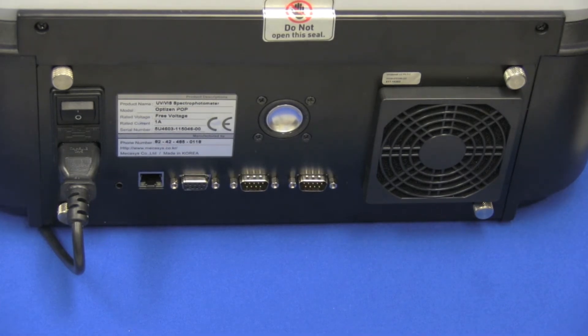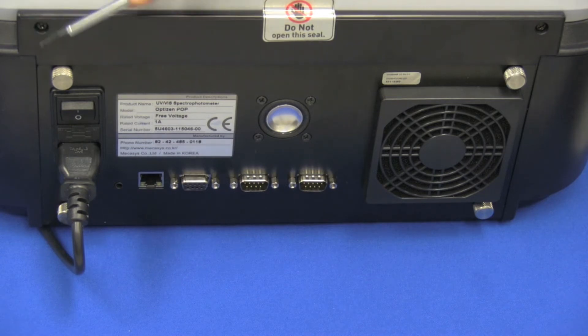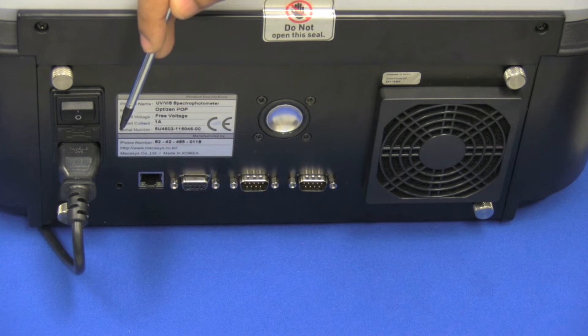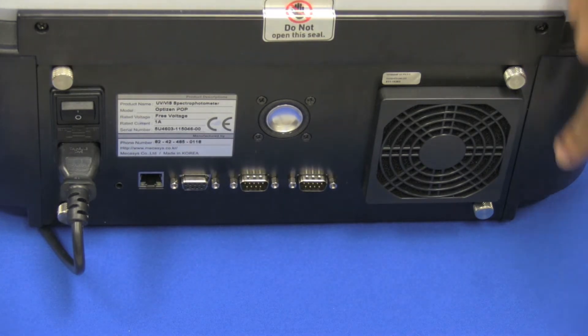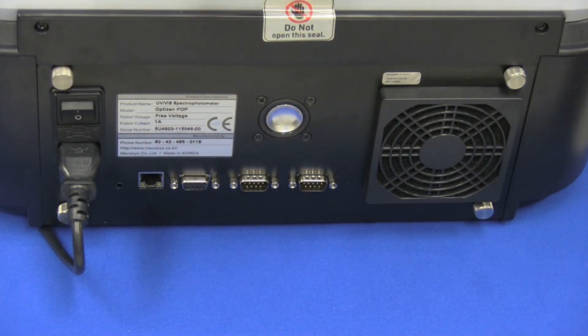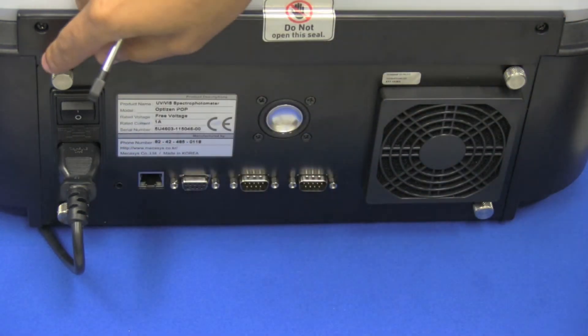Let's take a look at the back of the instrument. Starting with the power supply: the system has a free-voltage system, which means that regardless of your AC power input and whatever voltage that might be, the internal output of the instrument will always be a steady DC. So you don't have to worry about any power fluctuations. These four pieces here are easy-release screws that allow for access to the tungsten bulb or the deuterium lamp inside — very easy to remove with no tools required.